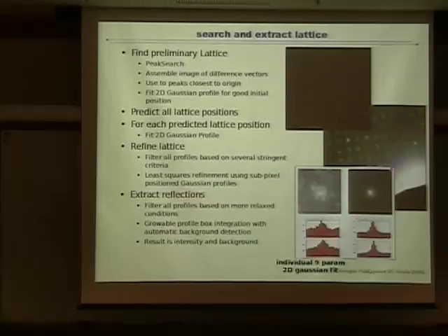This growth algorithm, if the overlap is severe, you will never have a stable background estimation, because no matter how large you grow, you always have some part of the repeat. And then this will be rejected. But it could be, of course, the case if you have sharp points and you go fairly far out, that you actually see two peaks as one, because then you have a stable background and you will get one wrong signal. That would have to be investigated on a per image basis.